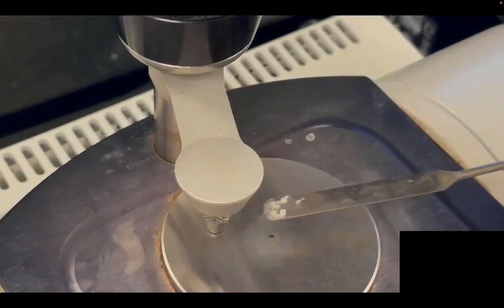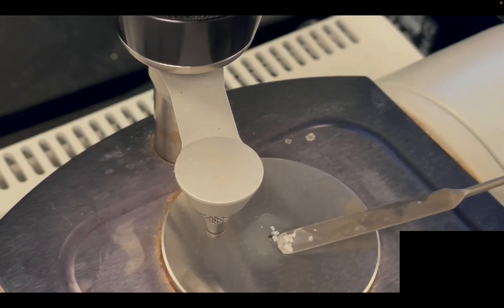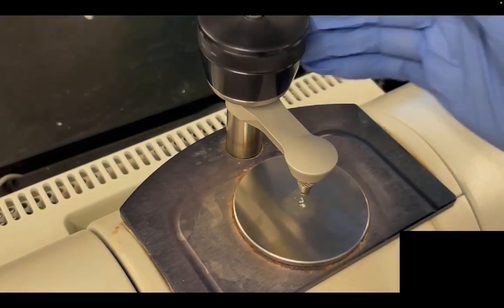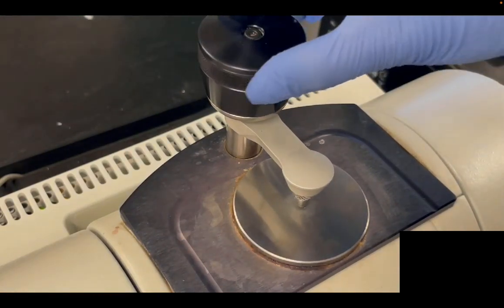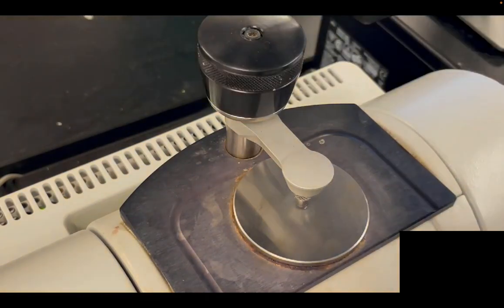If you have a solid sample, place only a little bit of this onto the crystal using your spatula. Center the arm and then lower it by turning this dial until you feel it pushing against the compound. Continue and stop until you feel a click, and this click will be obvious, so just avoid over tightening. Next, we can go ahead and analyze your sample.